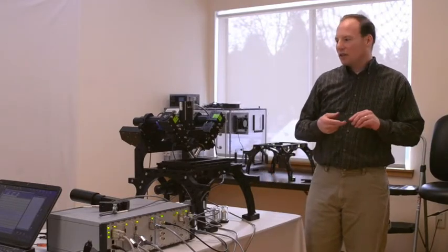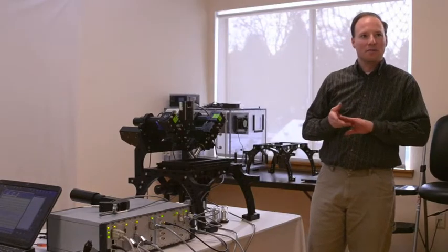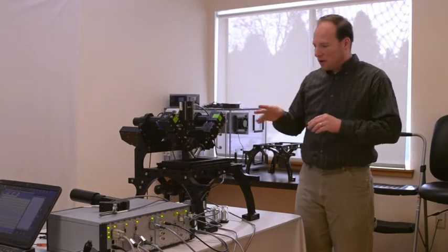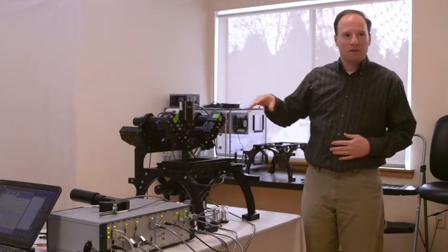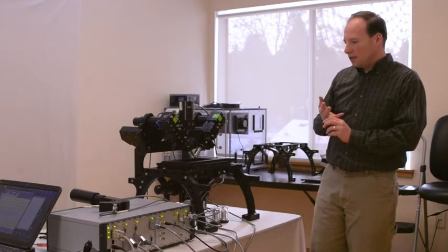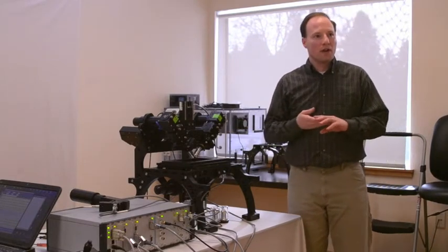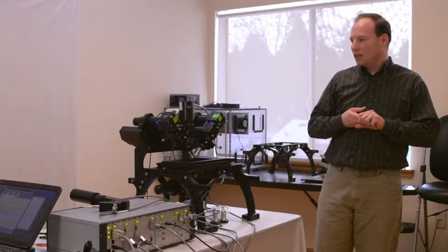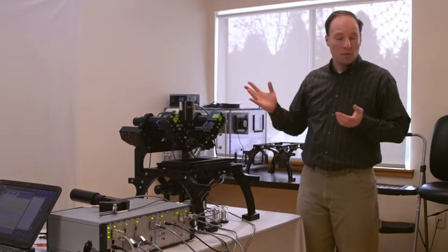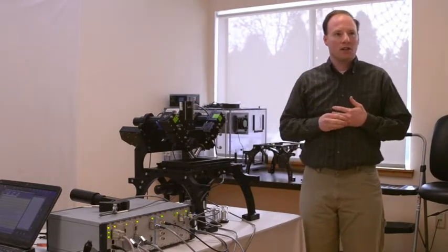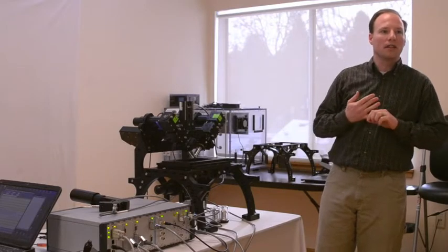DI SPIM stands for Dual Inverted Selective Plane Illumination Microscopy. The dual part means that we're taking two different views. Inverted means that it's mounted on top of an inverted scope, and then the Selective Plane Illumination is what's also known as light sheet microscopy, where we only illuminate one plane of the sample at a time.